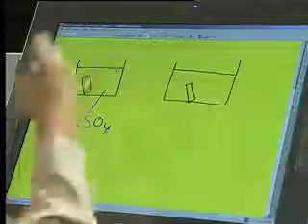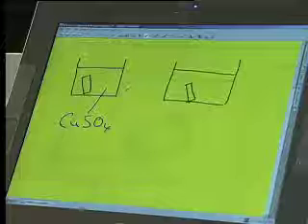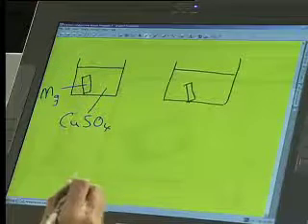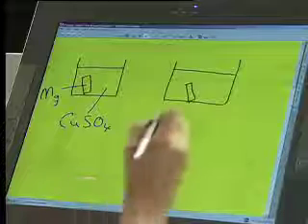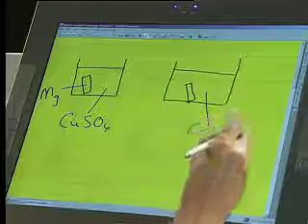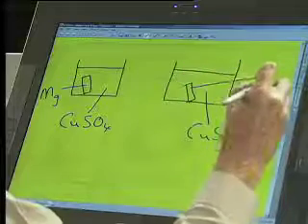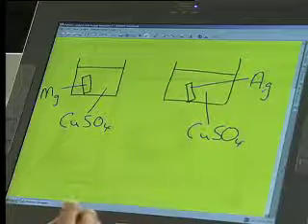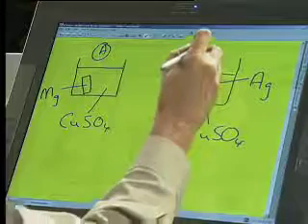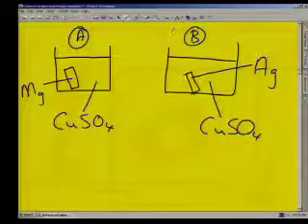I've got here in front of me two containers. In one container I've got a copper sulfate solution and a piece of magnesium. In the other container I've got a copper sulfate solution as well, and a piece of silver. In this particular question, they refer to the two containers as A and B, and they ask what you observed in each.